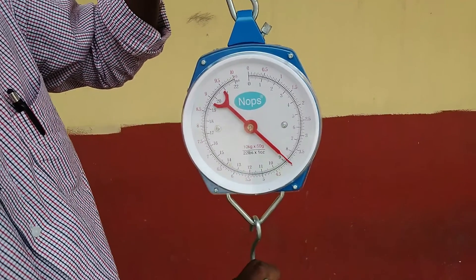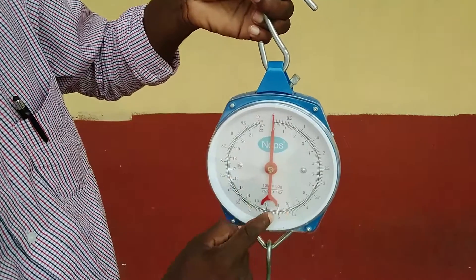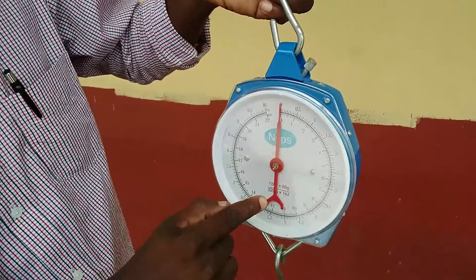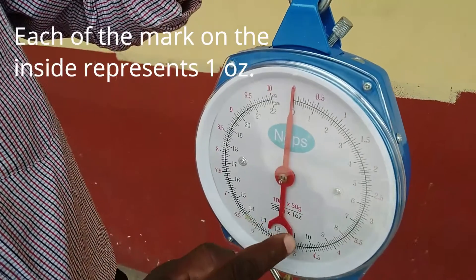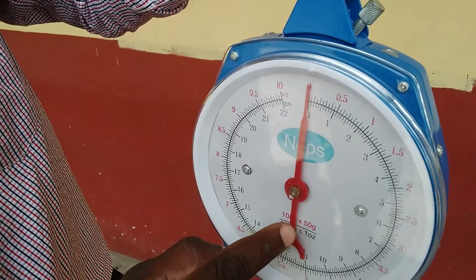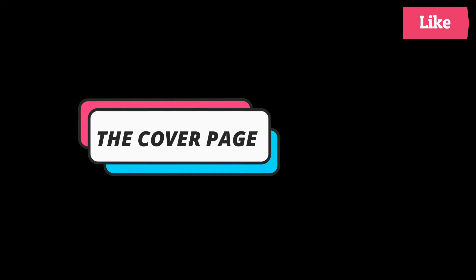Usually it is recorded in a table. Now the calibration of the scale — these little markings here, we refer to them as scale. That is very important. What it is saying here is that each of these marks represents one ounce and 50 grams on the outside.